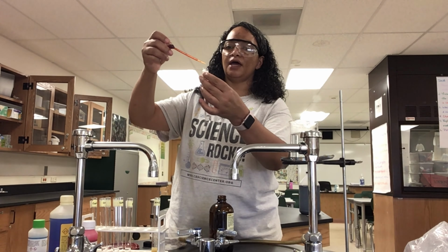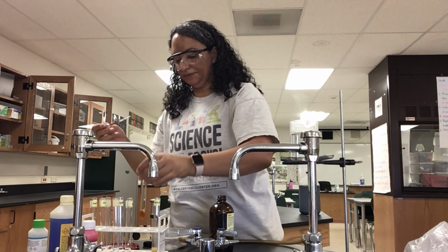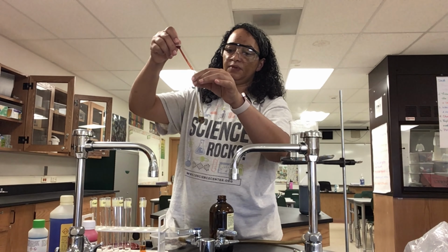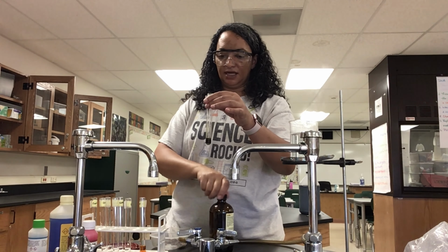All right, so I'm going to go ahead and put about 10 drops of iodine into my control. So you can see that it's a nice brown color. Then I'm going to go ahead and find my seed. I'm going to put about 10 drops into my seed. All right, squirt the excess back in there. Chuck the pipetter because I'm not going to use it again.